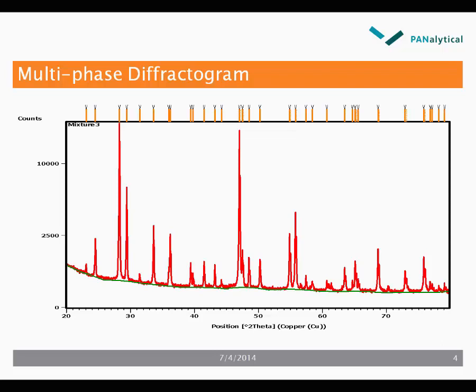And here is a diffractogram of a phase mixture. This is the sum of the characteristic patterns of three different crystalline phases. You cannot easily tell which peak belongs to which phase from this picture. Also, peaks from different phases can partially or fully overlap each other. The peaks at higher 2 theta angles are split into doublets because here a doublet wavelength is used. They count as one peak for phase identification.